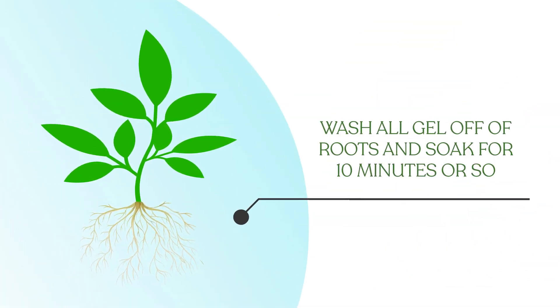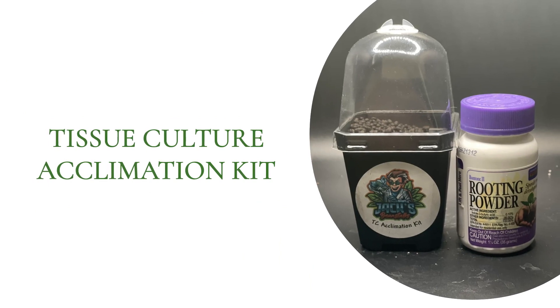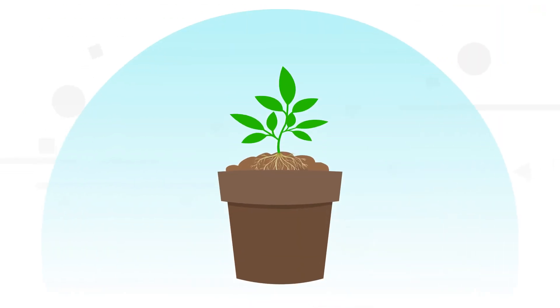Wash all gel off of roots and soak for 10 minutes or so. Then, use our tissue culture acclimation kit to place the plant into stratum or moss if you prefer.